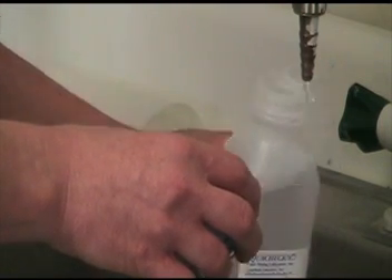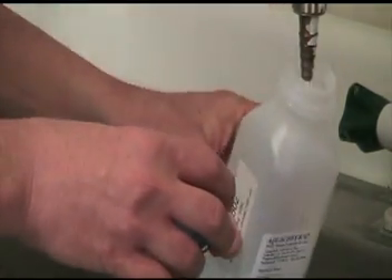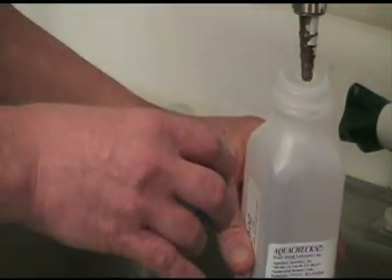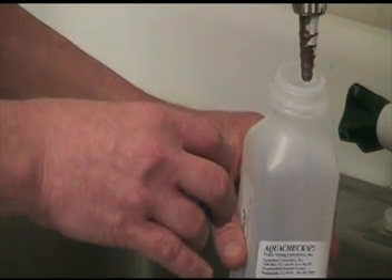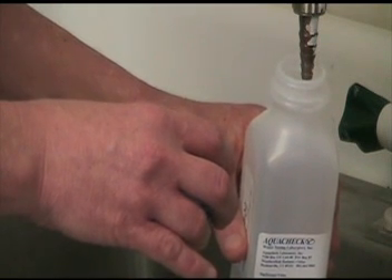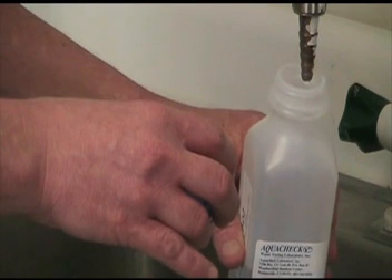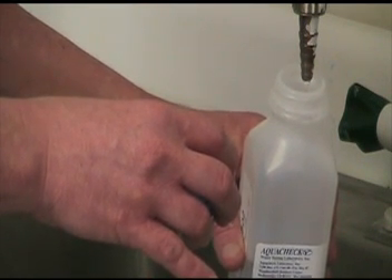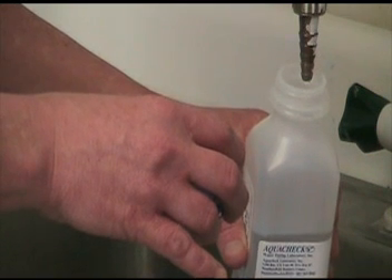The shortest hold time for the above parameters is 48 hours for nitrate and nitrite. Any portion of the sample used for metals analysis will be preserved at the lab with nitric acid to a pH of less than 2.0. Thermal preservation is recommended for physical characteristics such as hardness, alkalinity, and turbidity, as well as nitrate and nitrite.